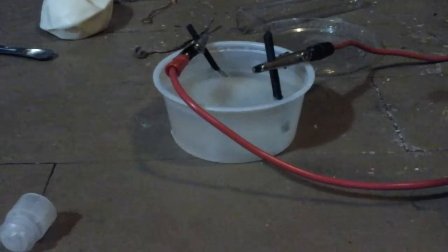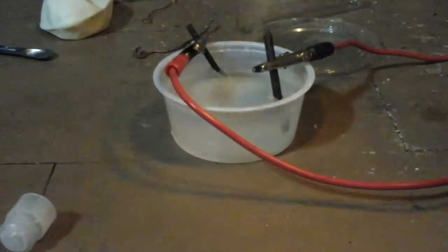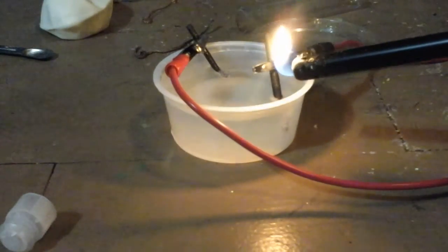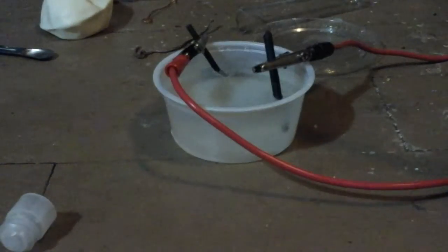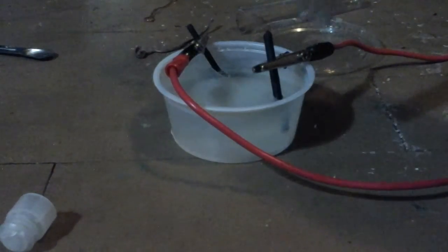Look at that — there's regular fire. It's increasingly hotter, so I think that's the hydrogen end.